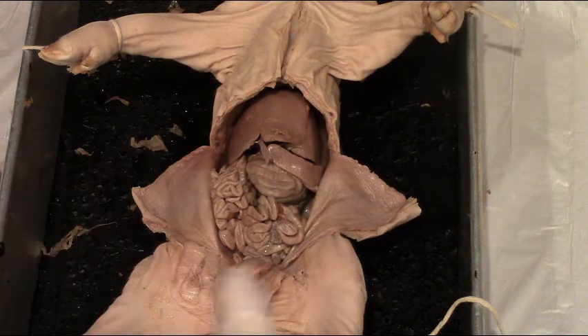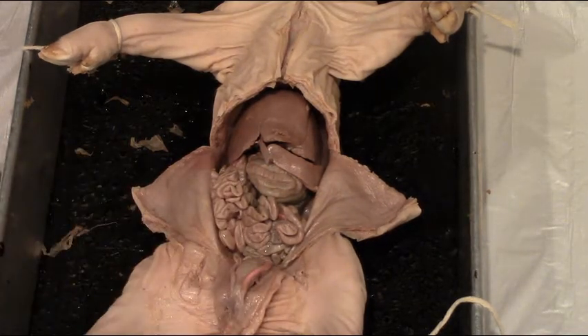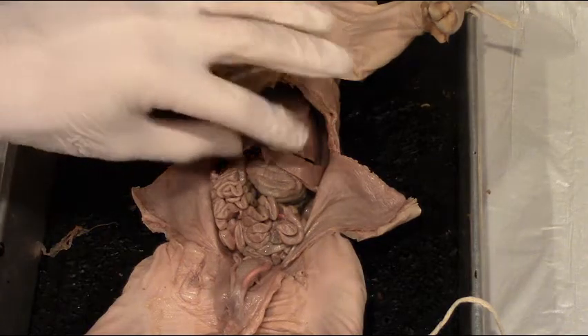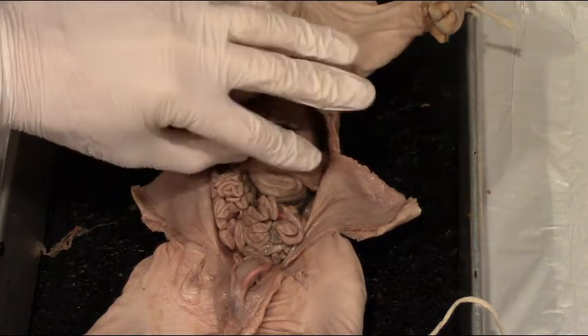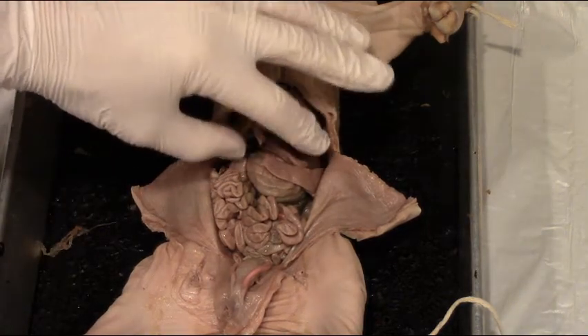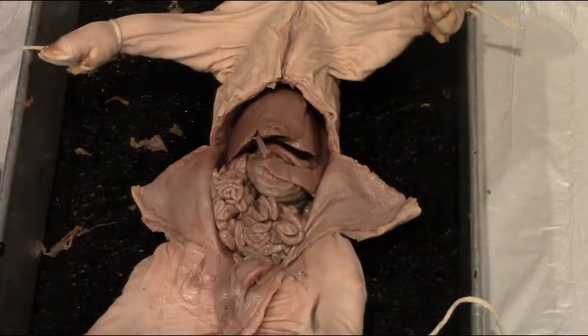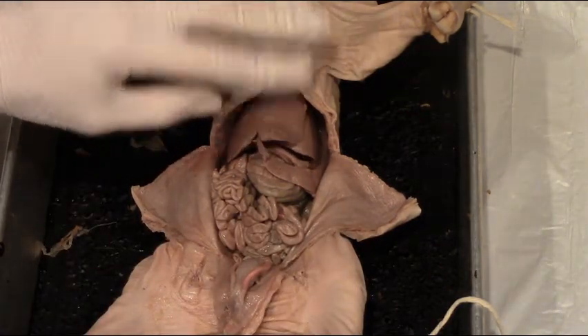We can now start moving some of the structures around to be able to see the next layer of organs within the pig's abdominal cavity. The first thing we'll do is actually pull up on the liver, and we want to be gentle with this because this is a fragile organ. The drier your pig gets, the less moisture there is, so the more crumbly this structure can be.